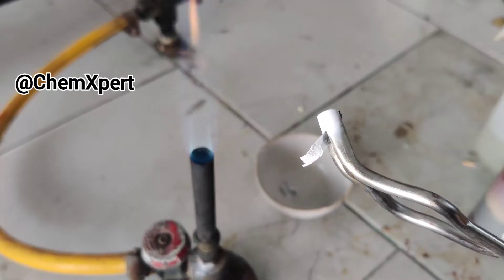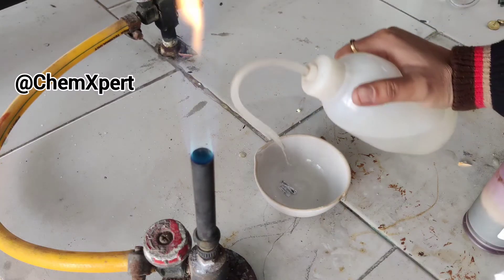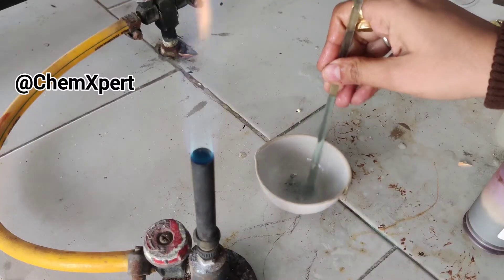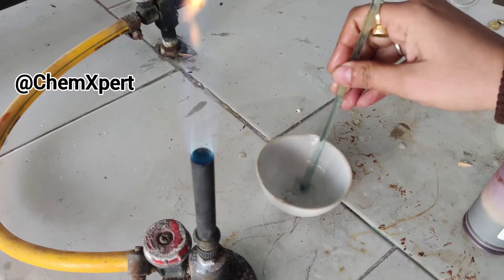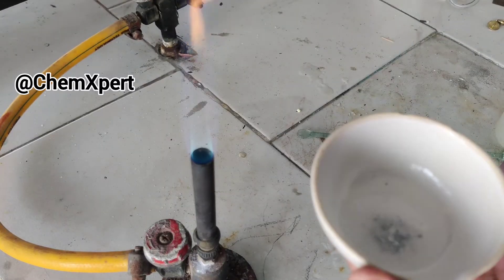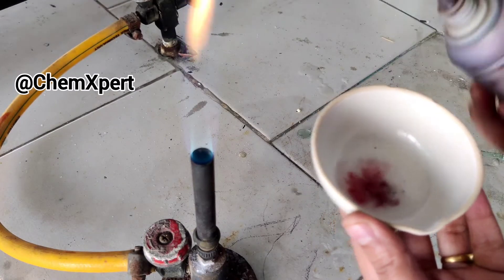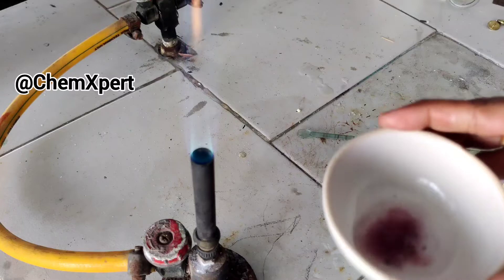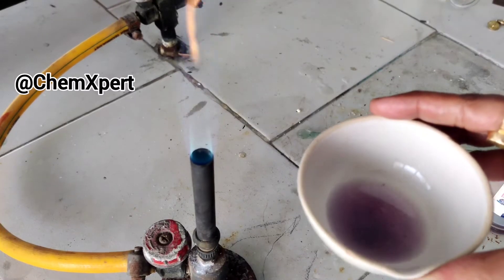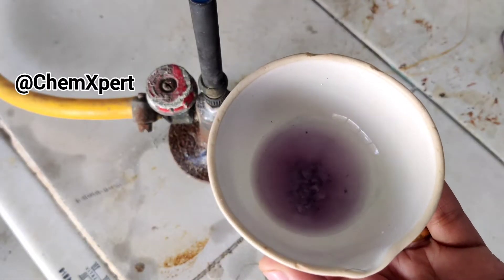Now I will dissolve this ash in water and observe its change with red litmus. I will add water into it and dissolve it. Then I add the red litmus — initially it is red in color, but when it completely reacts, it turns blue. You can observe it has now turned blue in color.